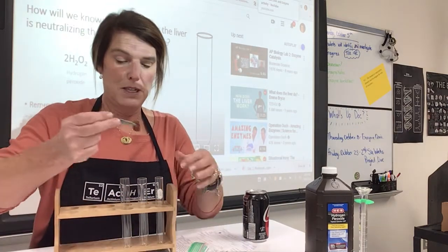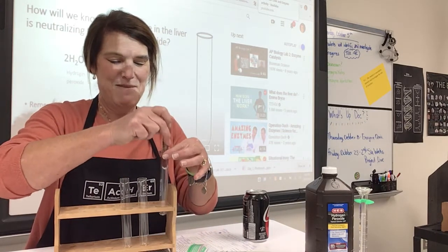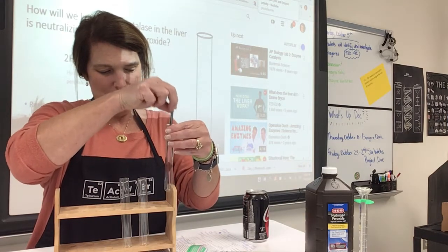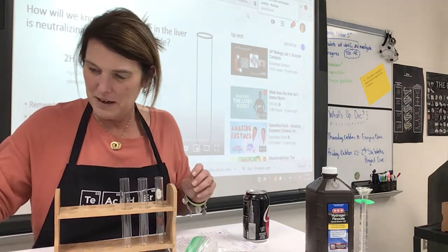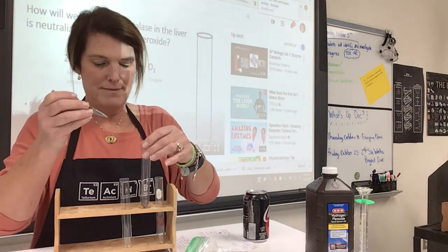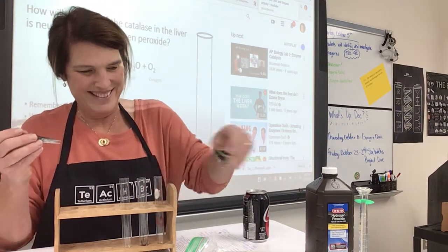Here's my raw piece of liver. Yum, yum, right? I may have to jam it down there a tiny bit. Come on, liver, go. Okay, and in the second one, I'm going to put my cooked piece of liver. This one's slowly sliding to the bottom.